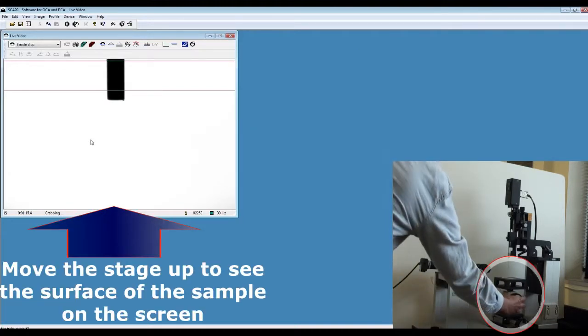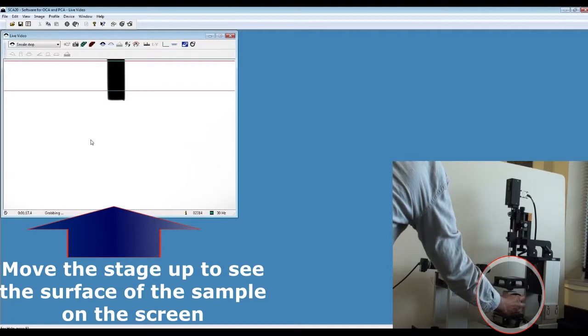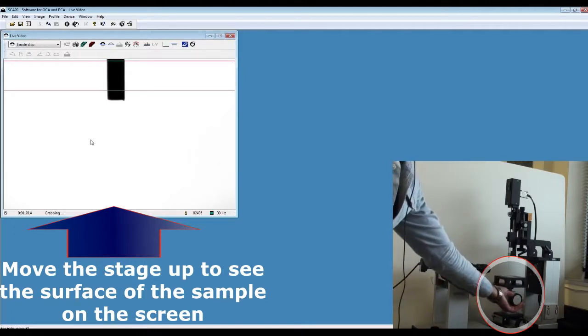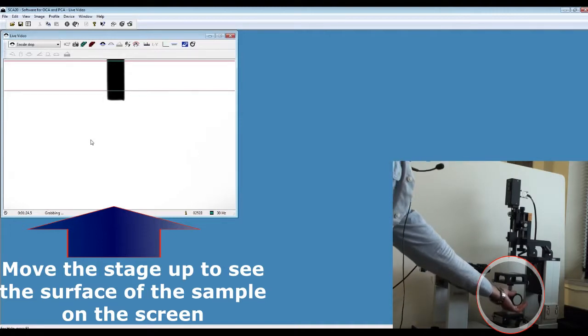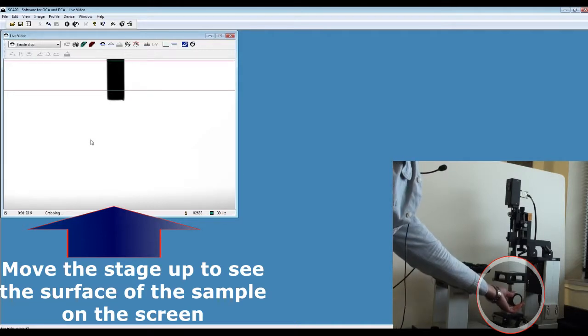Then bring up the sample using the designated knob for the stage, so you can see the sample in the live view window.